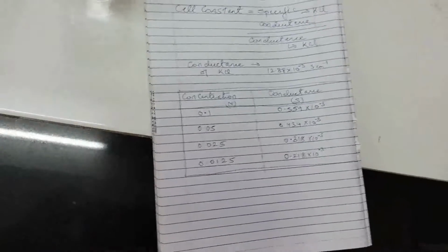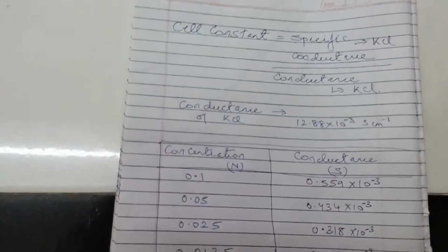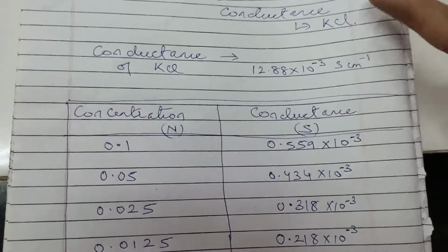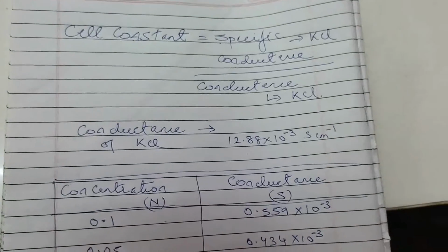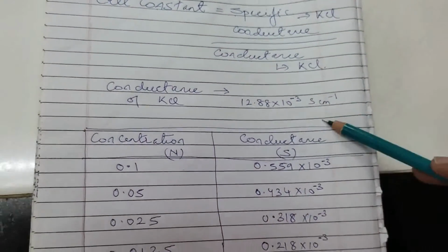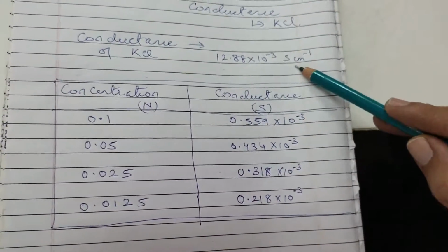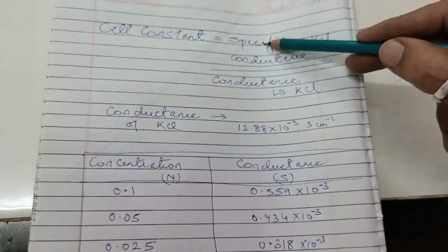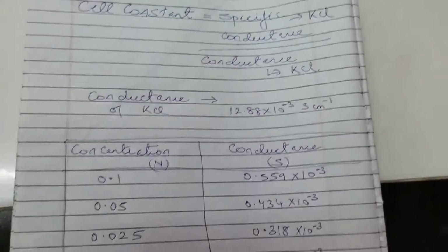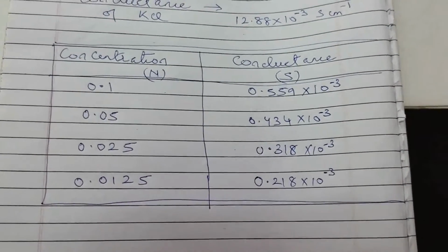Right, so that is it, my dear friends. The specific conductance at 25 degrees Celsius from the literature value is 12.88. The conductance of KCl that I showed is also 12.88. So if we divide this, we get the answer, cell constant equal to 1. Okay, and these are the values. Next I will show you the calculations.